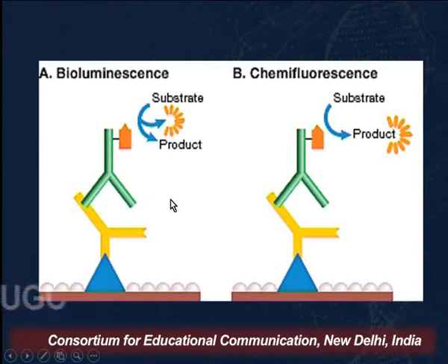Just reviewing the entire procedure, we isolated the protein from different cells and tissues under different conditions. For that total protein lysate, we prepare the sample, we add beta-mercaptoethanol, we heat the sample, and we add SDS so that the proteins are reduced to single polypeptides as well as masked by a negative charge all through. Then we fractionate it on SDS-PAGE, which is polyacrylamide gel electrophoresis.